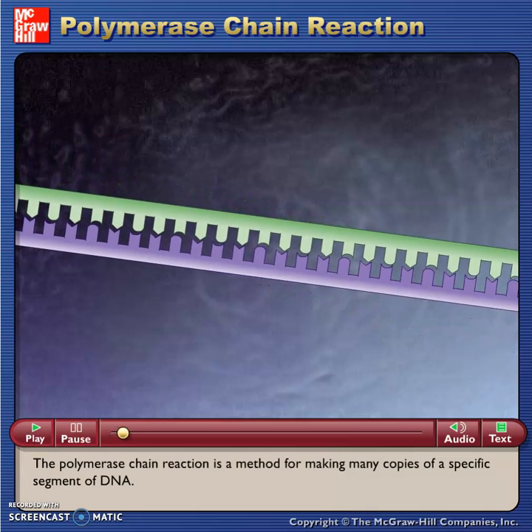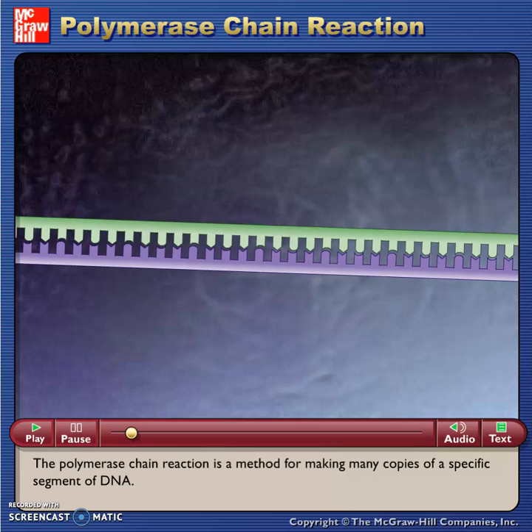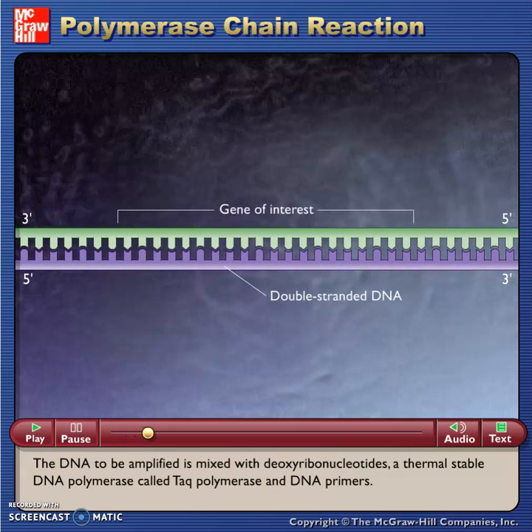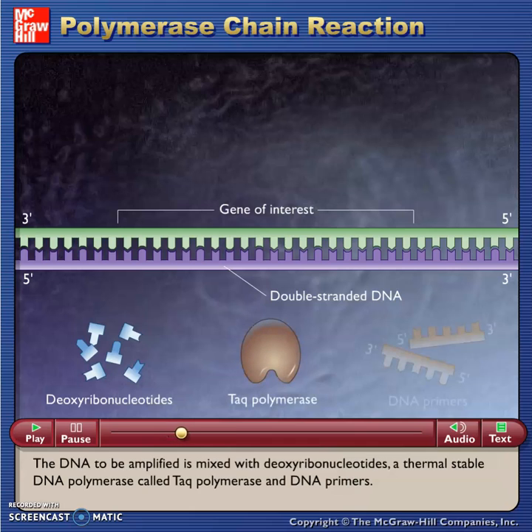The polymerase chain reaction is a method for making many copies of a specific segment of DNA. The DNA to be amplified is mixed with deoxyribonucleotides, a thermally stable DNA polymerase called Taq polymerase, and DNA primers.